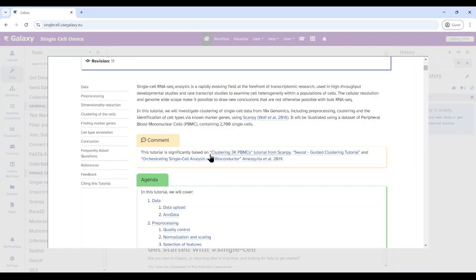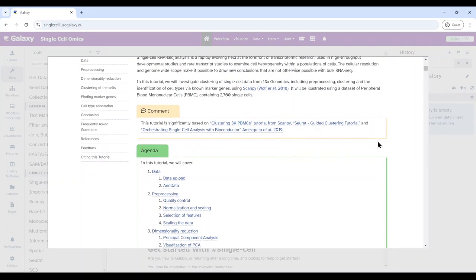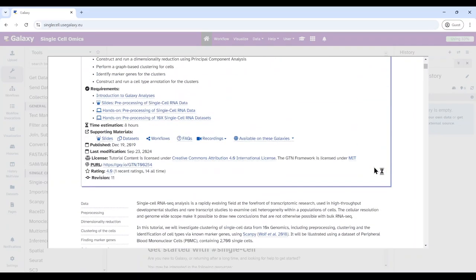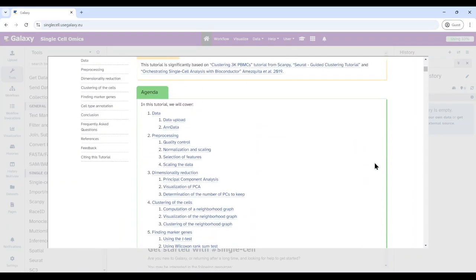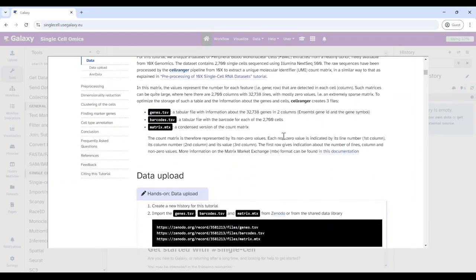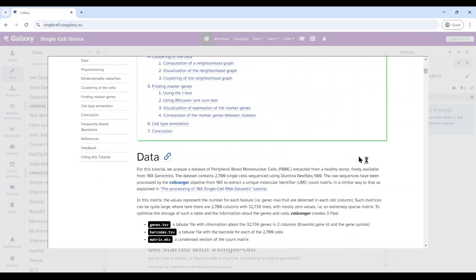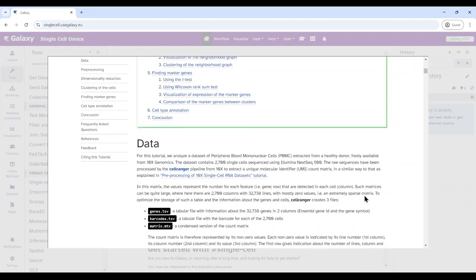It's also a very popular dataset used everywhere to showcase lots of tool suites. For example, ScanPy has a tutorial on how to cluster these 3K PBMCs, and there is also a Seurat tutorial and a Bioconductor tutorial around this dataset. The dataset was generated from 10x Genomics and is also publicly available on the 10x website.